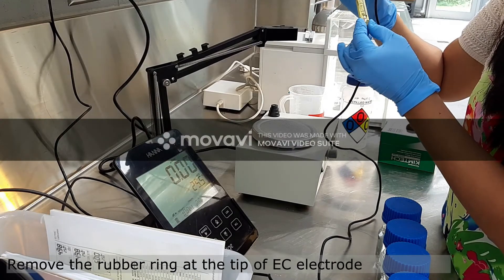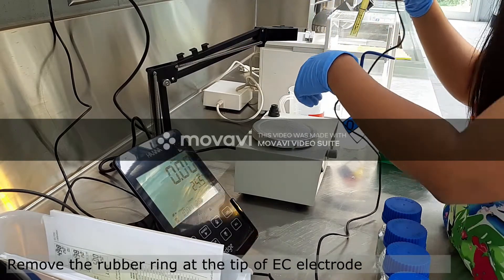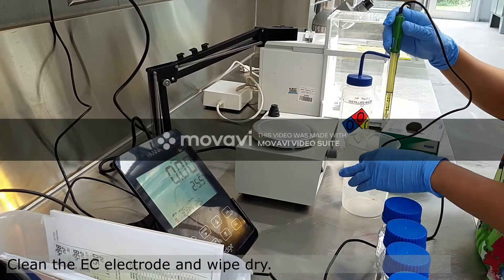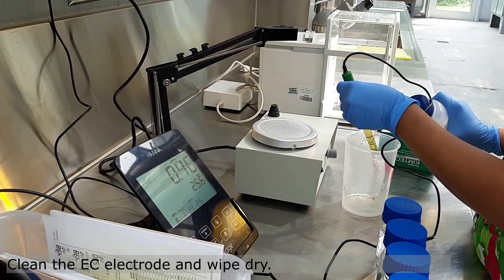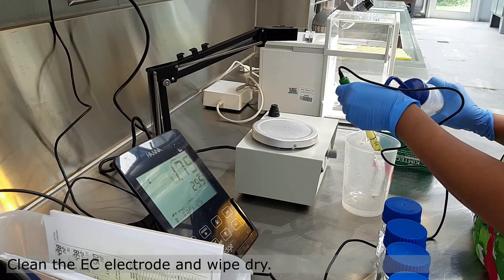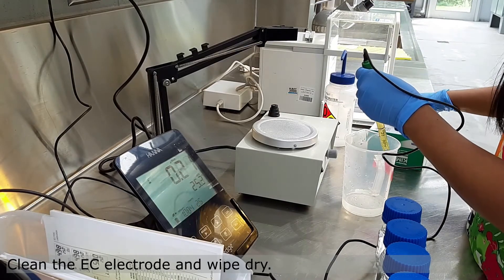Take the EC electrode and carefully remove the rubber ring that you can find at the tip of the electrode. Now rinse the bottom half of the EC electrode using distilled water. Use a beaker to collect dirty water.